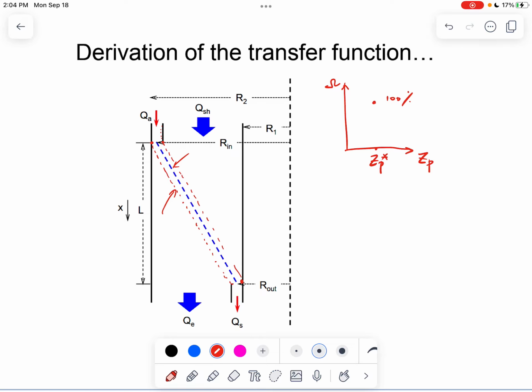What if the particles have a smaller size? So if the particles have a smaller size, then they're going to divert to the upstream location, right? Because their electrical mobility is going to be larger, right? So they move faster towards the center electrode. But then if the particle size is just smaller by a little bit, then you can imagine that there will be some particles that can still get collected, right? Because, for example, the particles along this outer wall of the inlet here, they can get diverted a little bit, but still get transferred in, right?